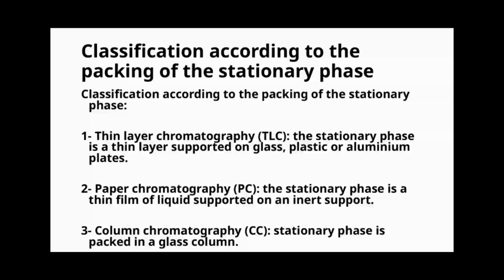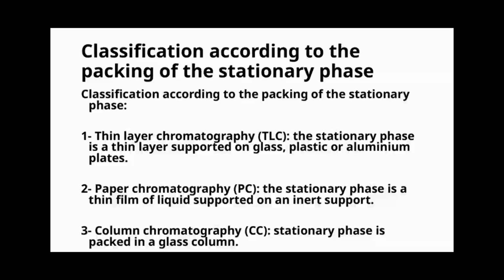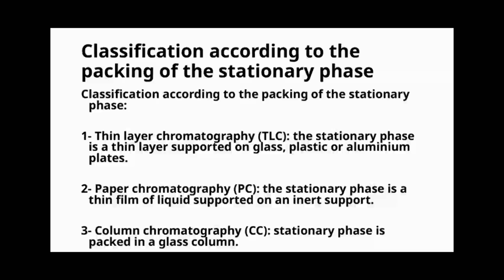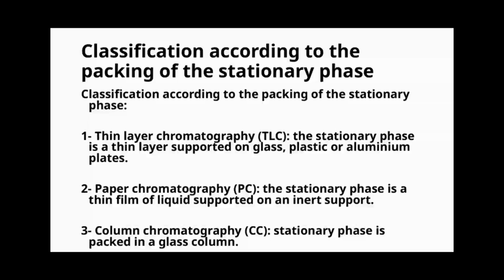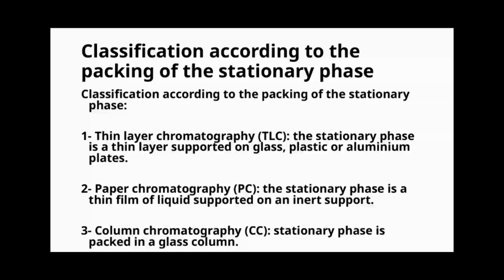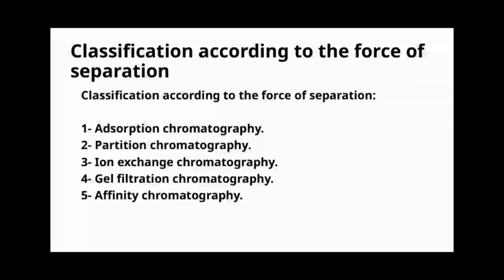Understanding these packing methods is key because they influence how the separation occurs and what kind of samples we can work with. Each method has its own advantages depending on the sample size, complexity, and the level of resolution needed. So, as we go along, keep in mind how these packing techniques fit into the broader picture of chromatography and its applications. Let's explore the classification of chromatography based on the force of separation.